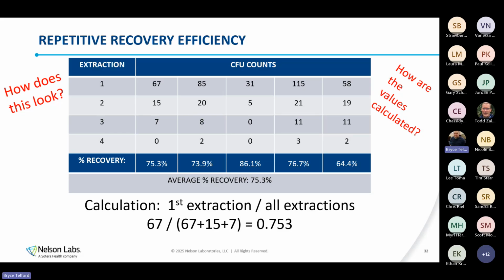So it is something that we do see sometimes, is we will actually see the bioburden just stay there. That may mean that the product is falling apart and we're actually shedding more and more bioburden. We might not be doing a very good extraction, so we might try extracting the product differently. If the product is falling apart over time, we may want to have an extraction that is longer.